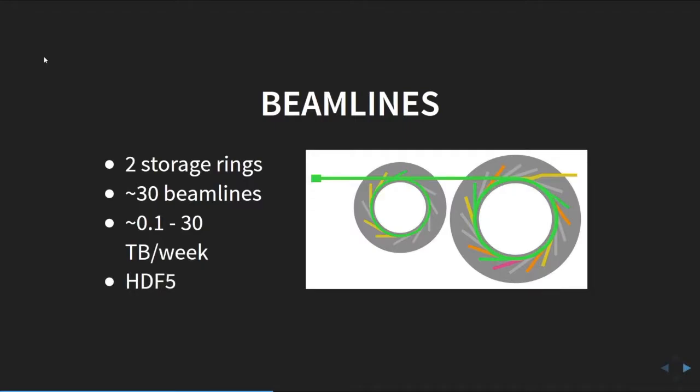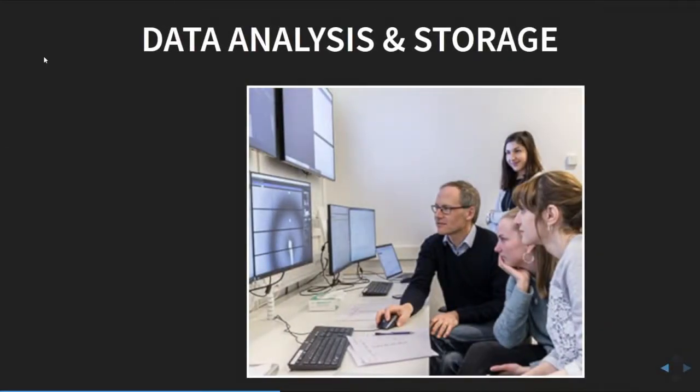All of the data coming out of all the beam lines will be in HDF5 format, or they should be. So first, when the data comes out, people sitting at the beam lines can view the data, like these happy users and staff at one of our beam lines. They have some machines at the beam line where they can do some rough analysis on data that's been stored and dumped into the storage facility at the laboratory.